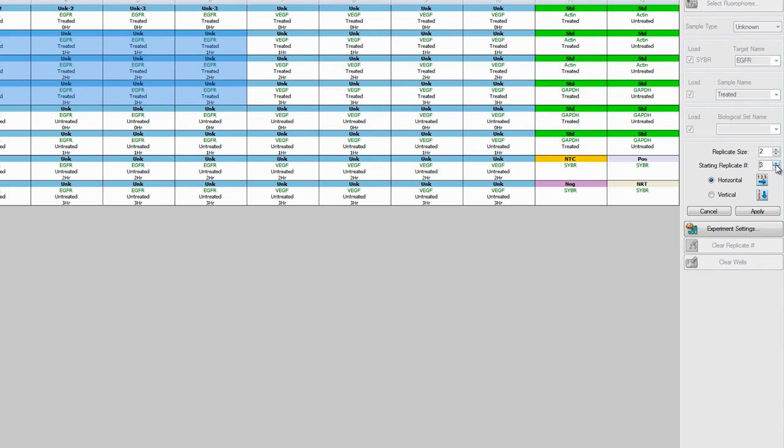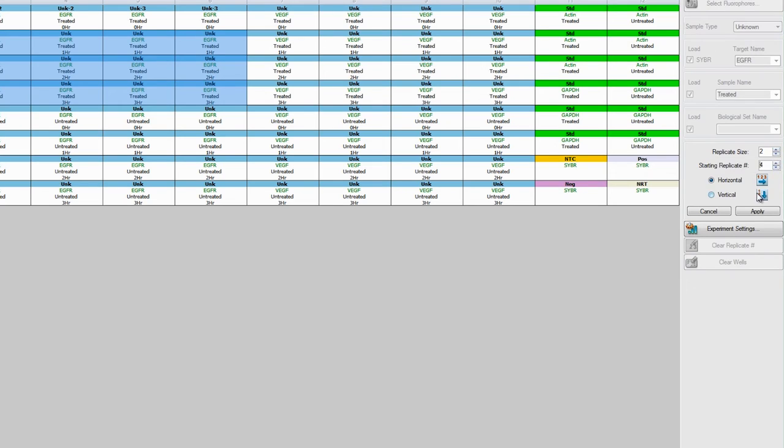Then, in the Starting Replicate Number box, select the number that is one more than that of your last replicate. Select the direction of the replicates and click Apply.